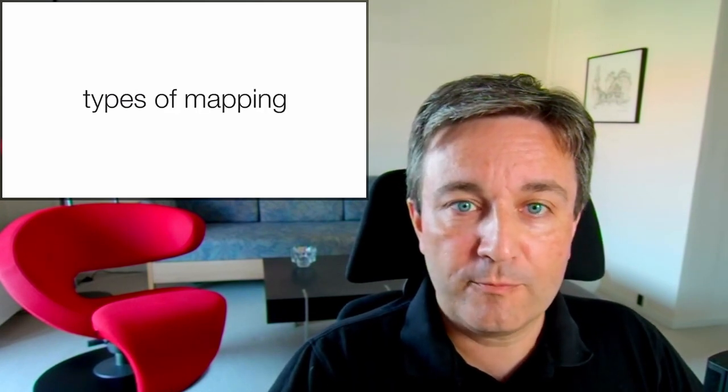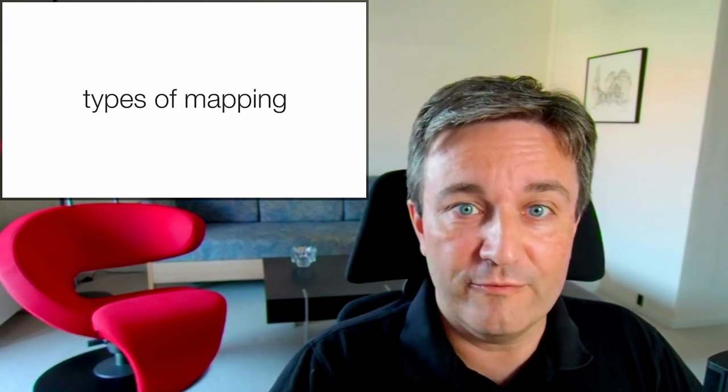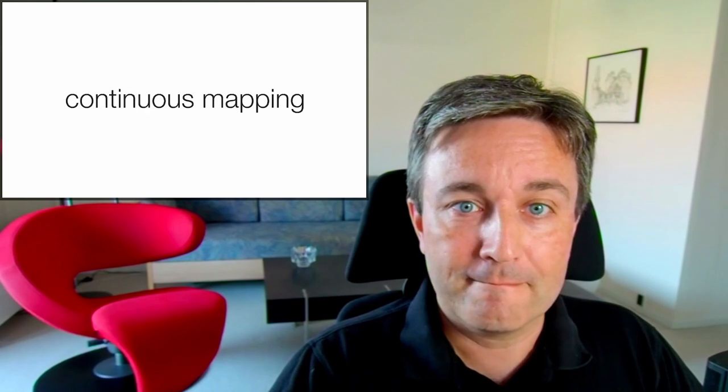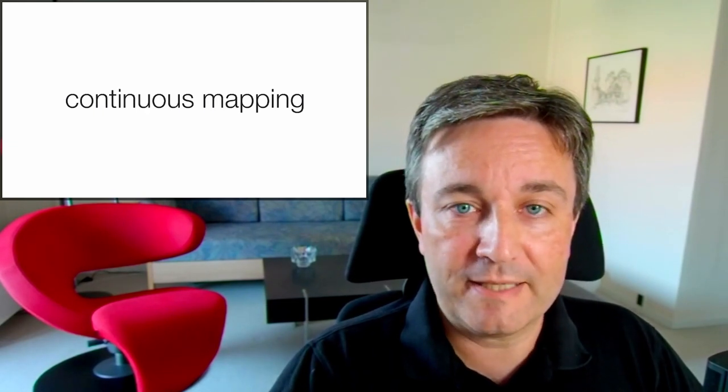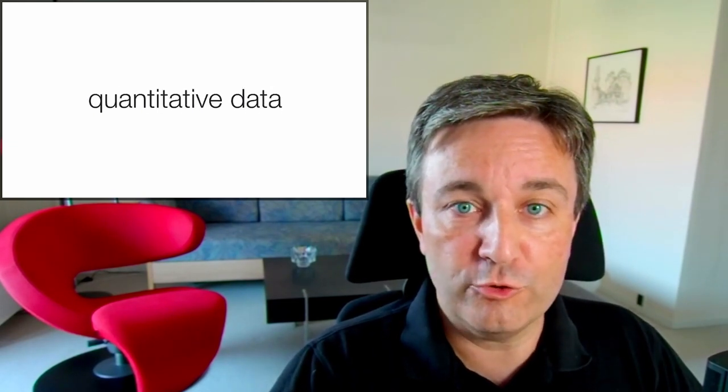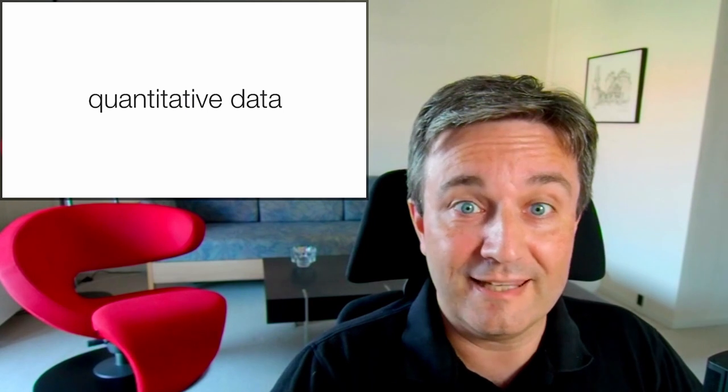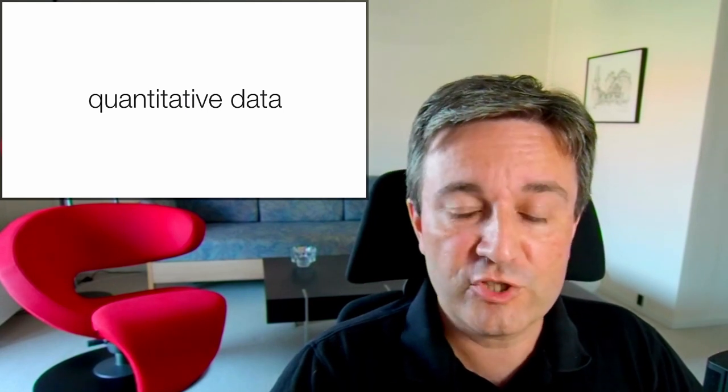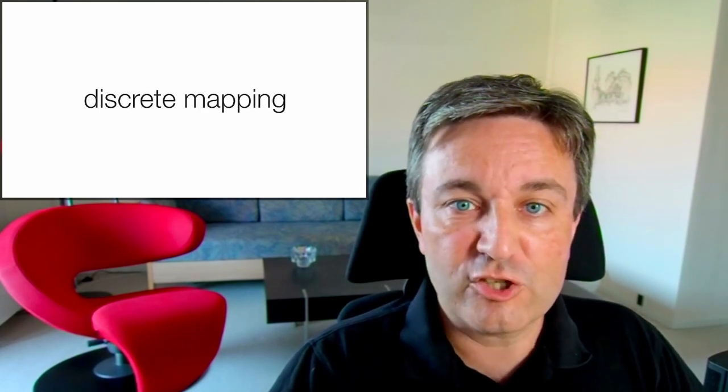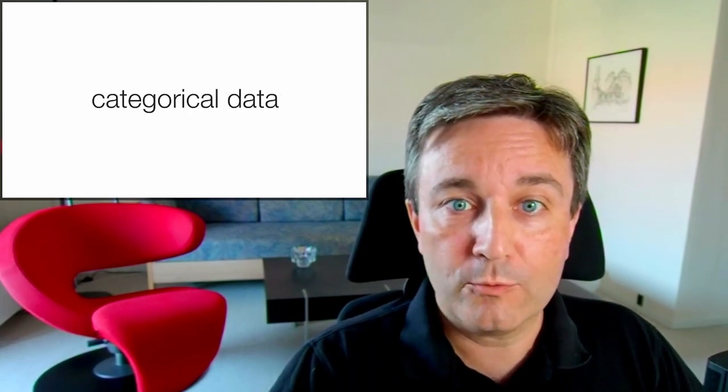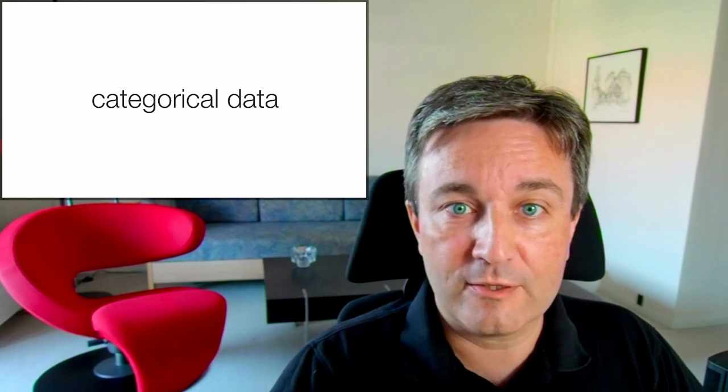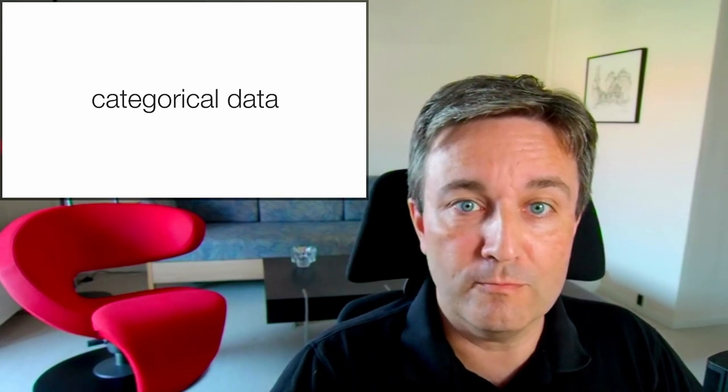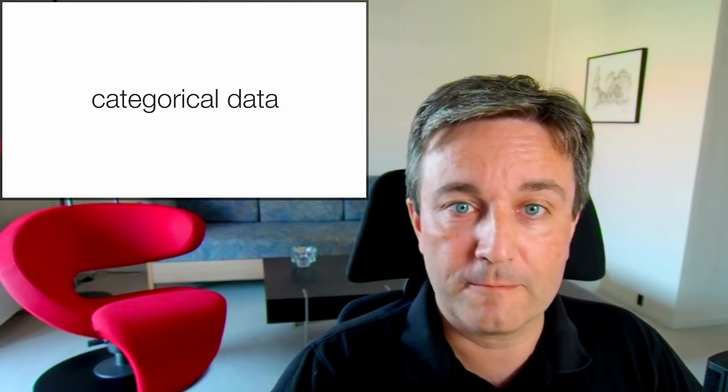There are several types of mappings. You need to know about two of them mainly. There's the continuous mapping, which is what you use for quantitative data, like if you have log fold change values. And there's the discrete mapping, which you use for categorical data, such as if you want to mark different classes of proteins.